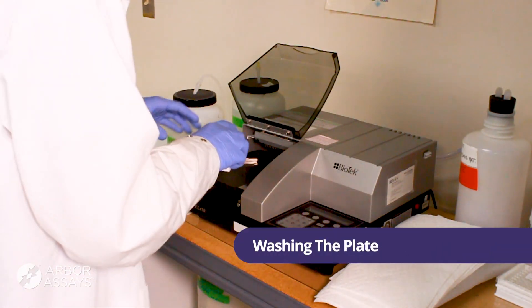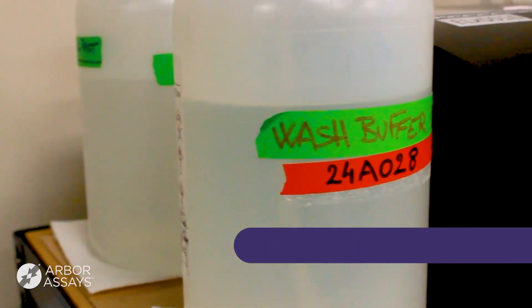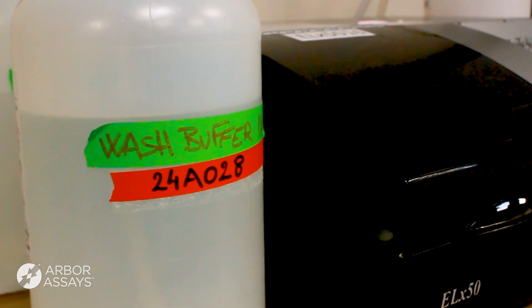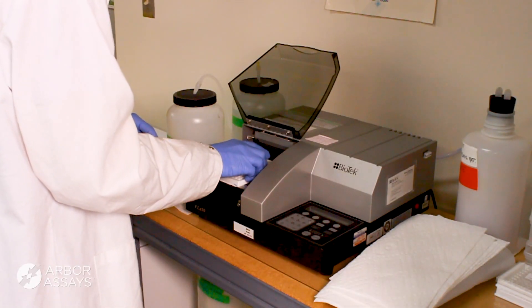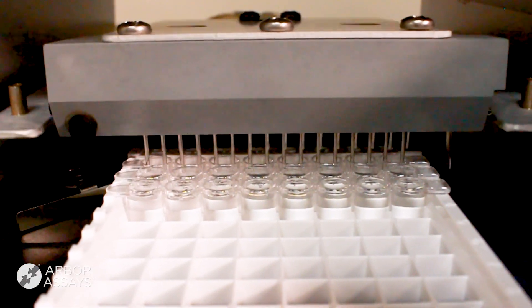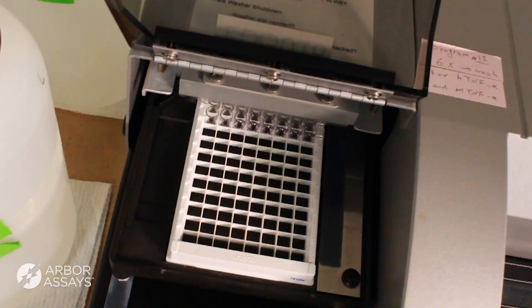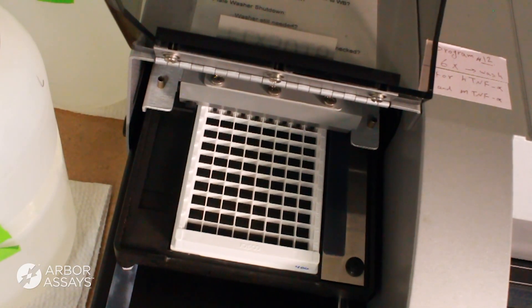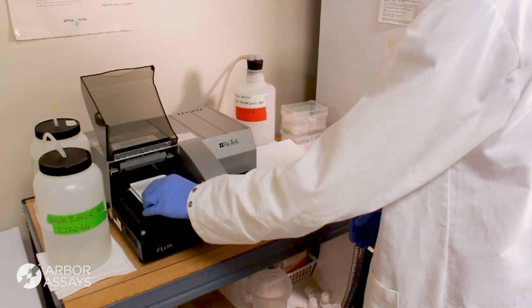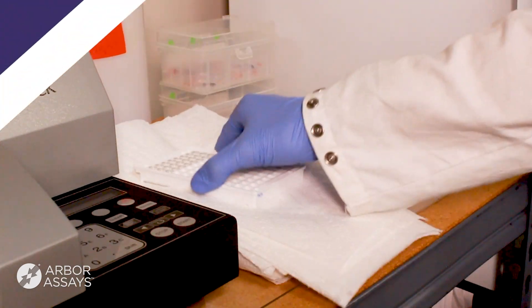At the end of the incubation, wash the plate using the diluted 1X wash buffer. If using a plate washer, thoroughly prime the plate washer with 1X wash buffer prior to using. Other wash buffers may contain sodium azide which inhibits peroxidase activity. The number of cycles and volume of 1X wash buffer for each assay are indicated in the assay protocol. After the washing procedure, invert the plate one final time and firmly blot on a fresh, clean, lint-free tissue.